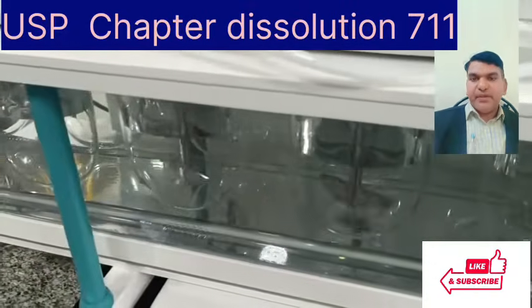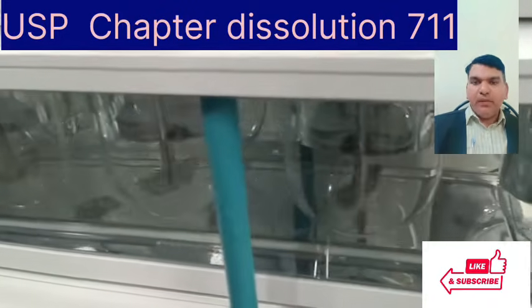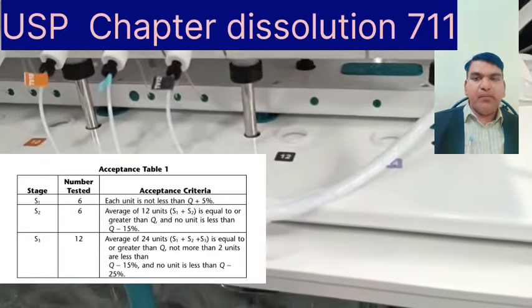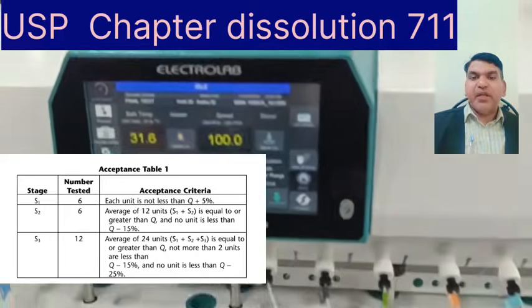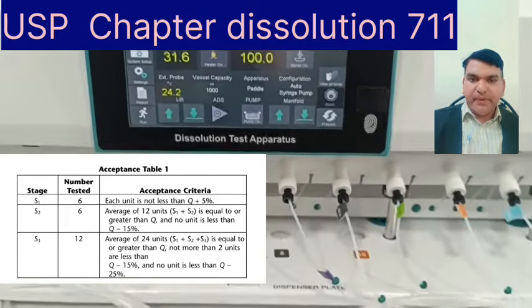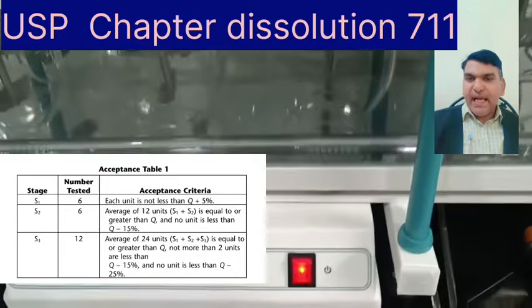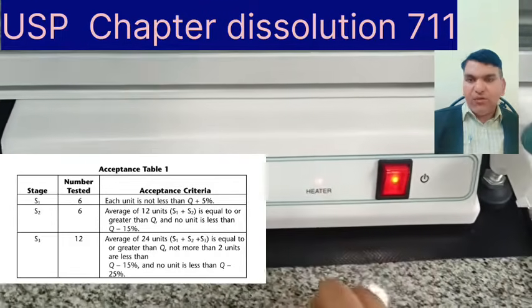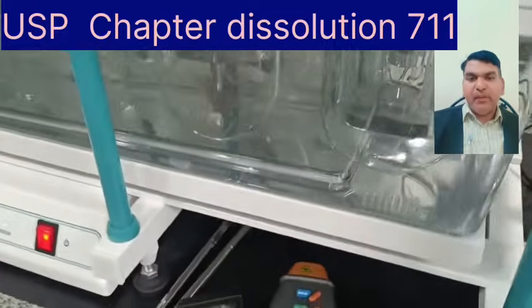Now let us discuss how this Q value can be calculated. You must have seen the dissolution specification applied not at only one step, but at three different steps: S1, S2, S3 in case of immediate release dosage forms, or L1, L2, L3 in case of modified release dosage forms. We will take one example to understand how the Q value at these several steps can be identified. And once you understand the value of Q, you can also understand whether the product meets the specification or not at any given stage.